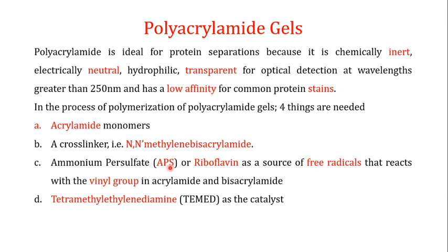When you talk about the 2D, whether you talk about isoelectric focusing or the SDS-PAGE, in both cases the matrix or the polymer that is used is polyacrylamide. So you should have a firm understanding of what polyacrylamide is and how polyacrylamide is made.